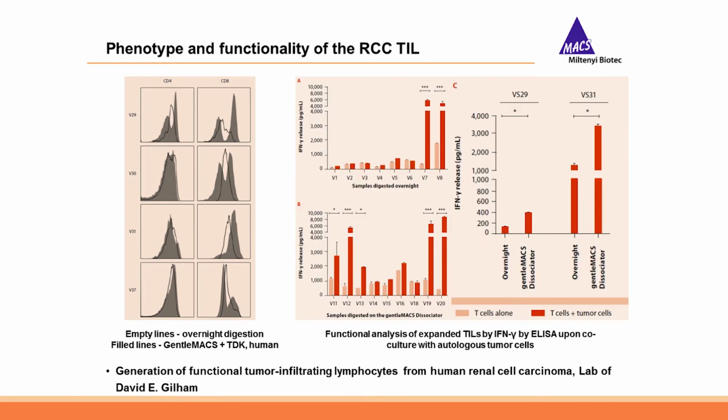And moreover, also because of the very gentle dissociation procedure, you see that the functionality of the cells is actually significantly improved. So by co-culturing the isolated TILs with autologous tumor cells from these patients, you see that here by readout interferon gamma release by these co-cultures, the T-cell activation is much better with our procedure than with the classical overnight digest.